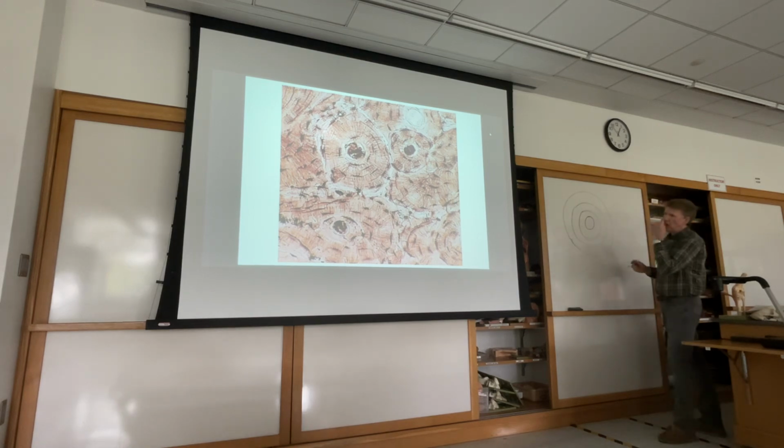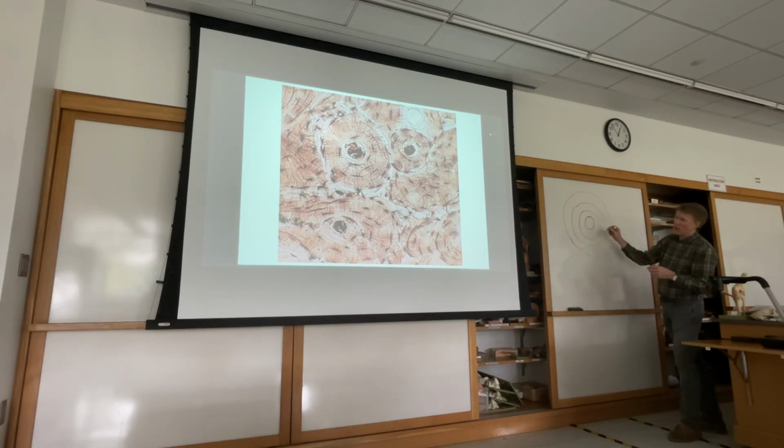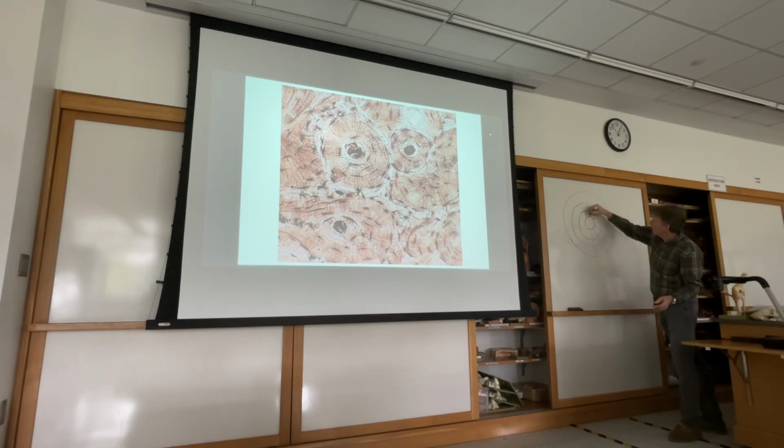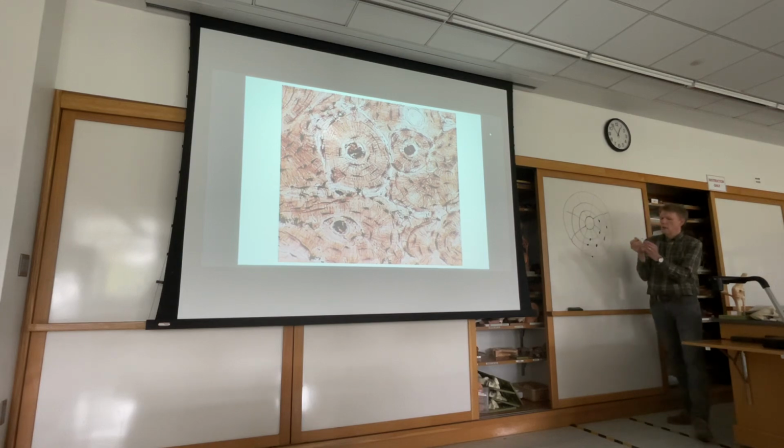And then if you look really closely, there's actually little lines that jut outward from the middle, almost like rays of sun. They come out like this, or spokes on a wheel. It's hard to see those, but they're there. And then also sitting within these circular things, you've got these little black dots that are scattered everywhere like this. Okay? So, what are you looking at?